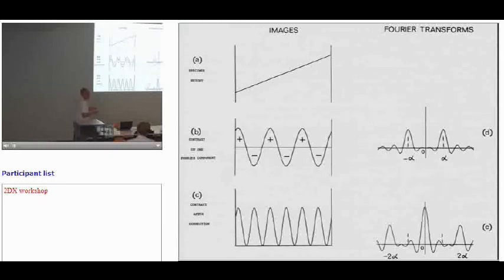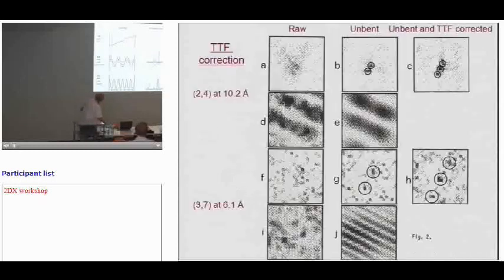So in a way, it's correcting the signal to noise in the image as well. And then the Fourier transform of that brings you back your correct amplitude and phase in the correct position, and you get those 2 wings, which are artifacts of the way you've done it, and you ignore those. They don't contain any more information. It's the same information that was there in the beginning. And in that slide that Carsten showed, where he showed a correction, he had, let's say, ghosts outside of the real corrected structure, his little checker square thing that had been moved out. That's essentially the same kind of thing.